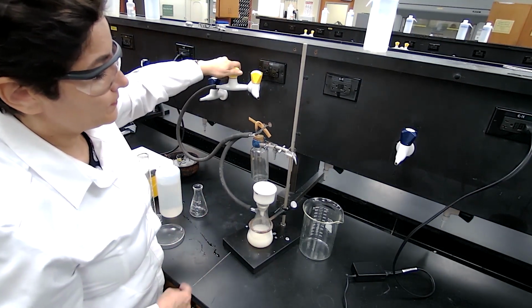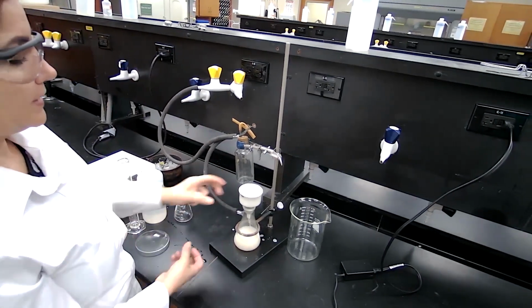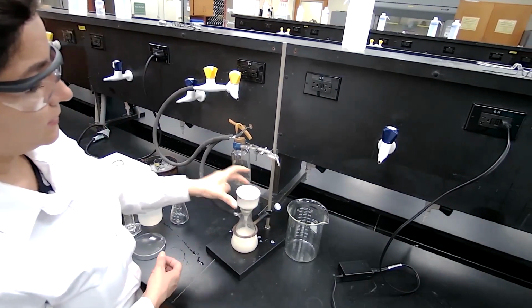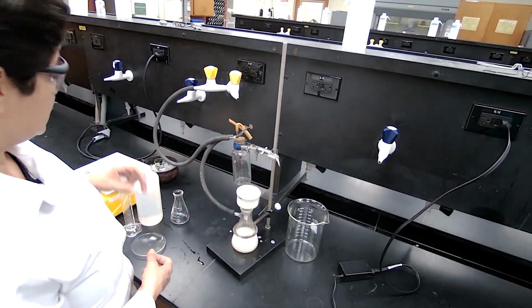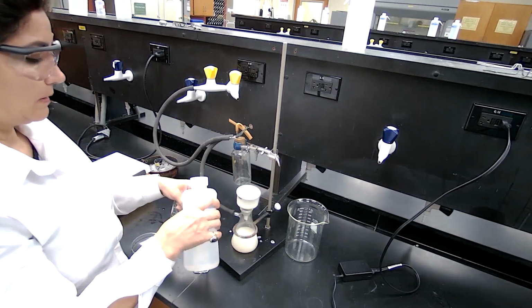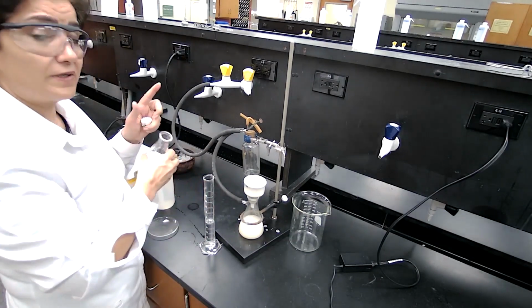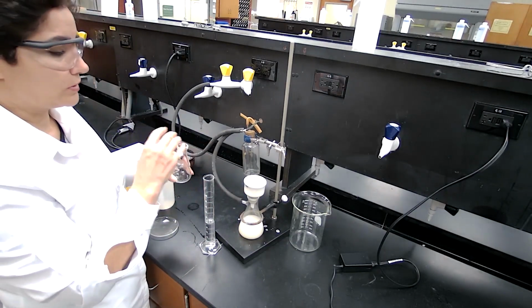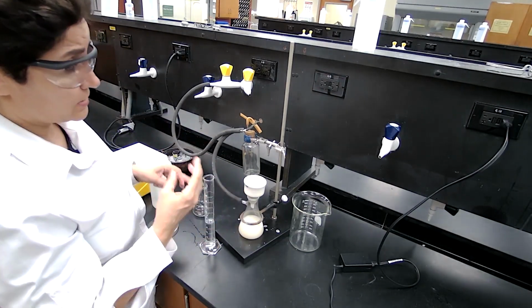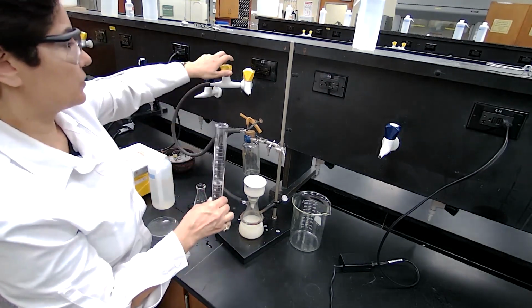Turn on the vacuum, remove the water by vacuum filtration. Perfect. We repeat this 2 more times. While I was transferring the crystals, I added some water. I'm also washing the crystals 3 times, each time with 50 milliliters of water.